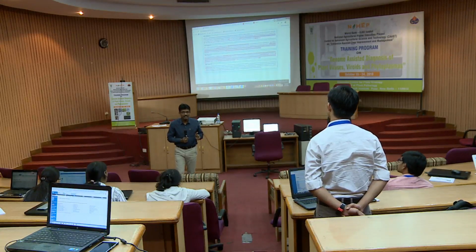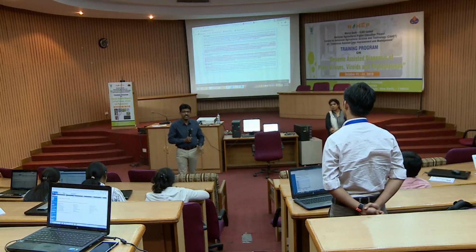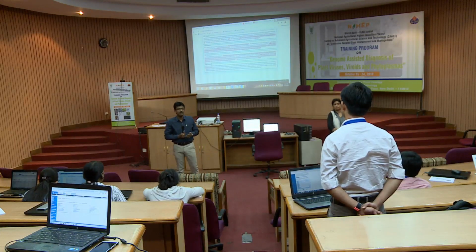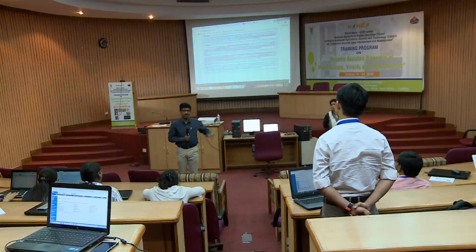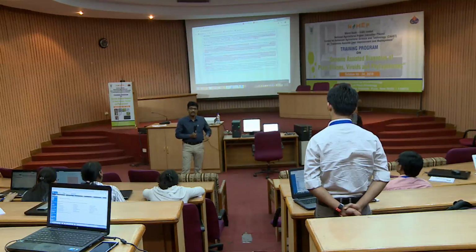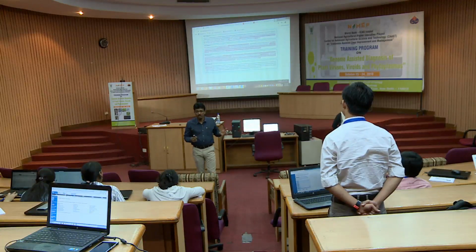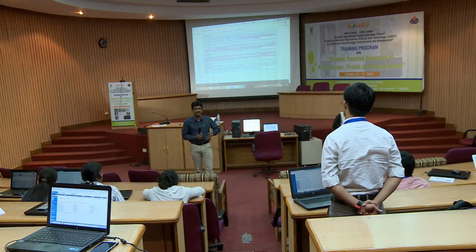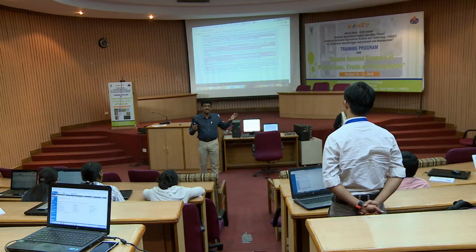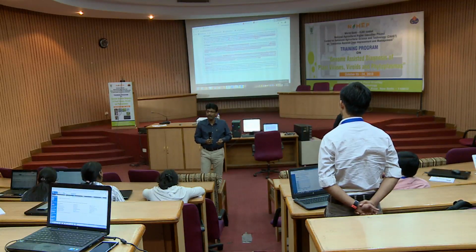Be transparent, give as much information as possible while making the data sheet of your sequences, so that your data is referred to by other people. They will be using your data in their analysis. Genomic science is all about involving other people who are working along similar lines, and only then are the databases in the public domain of any use for anybody, right?